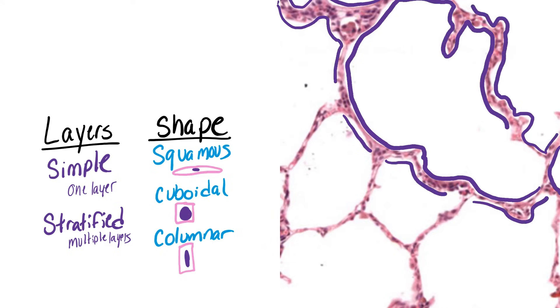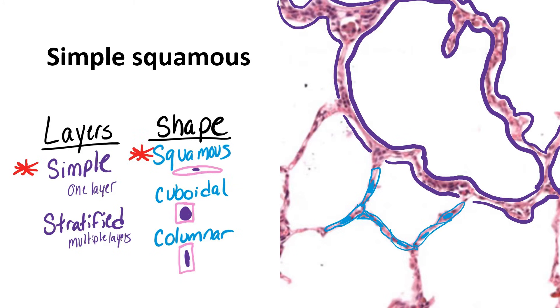This slide is mostly open space, and lining that open space is a single layer, so it is simple. And although you cannot see the shape of the cells clearly, they are definitely not cubes, definitely not columns — they are those flat little pancakes, which makes this simple squamous.